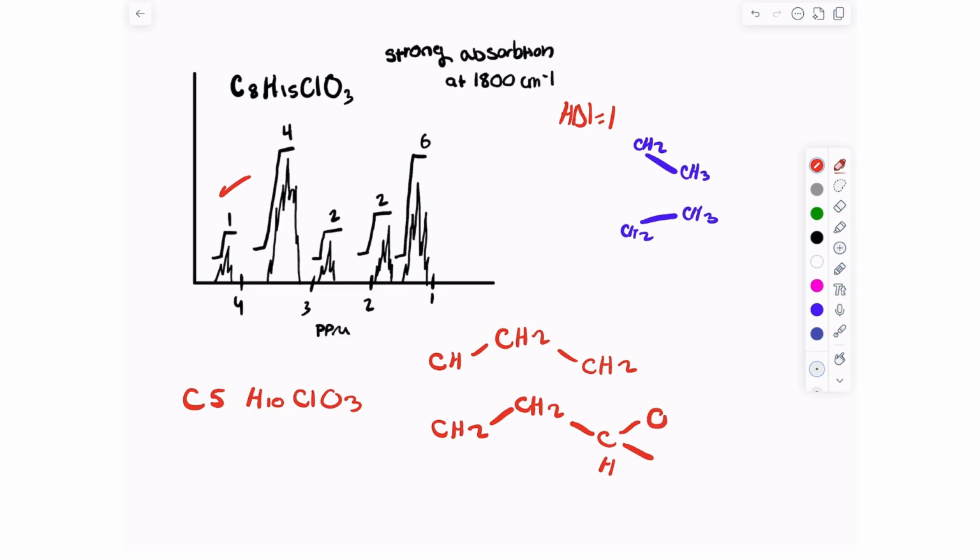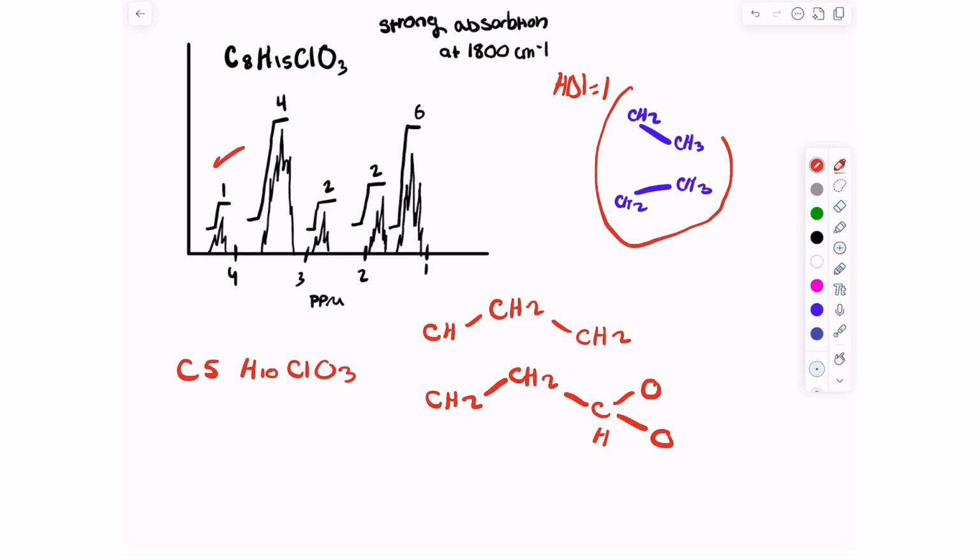And for this to be a CH, there has to be 2 other bonds. Let's see. We've still got these proposed ethyl groups, which I think these are ethyls, because if you notice, if we used 2 oxygens like this, we're going to go down to this.